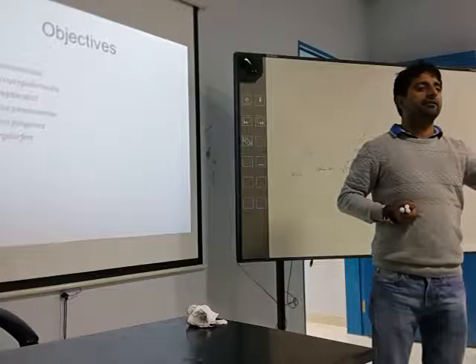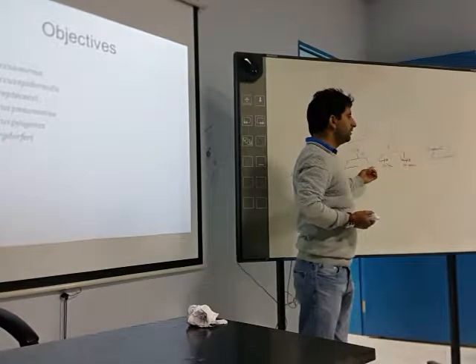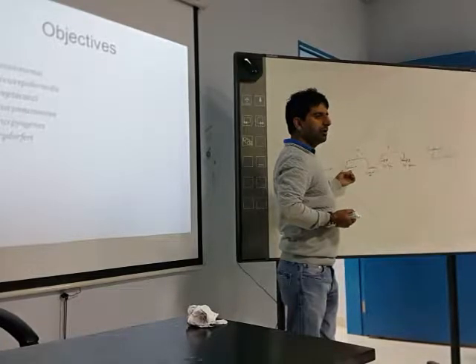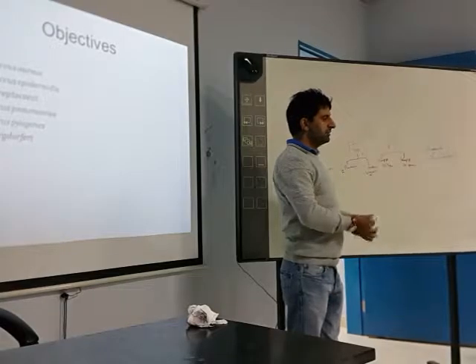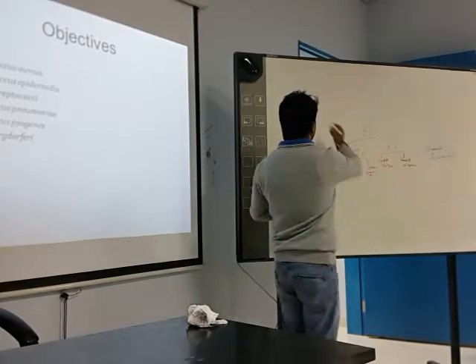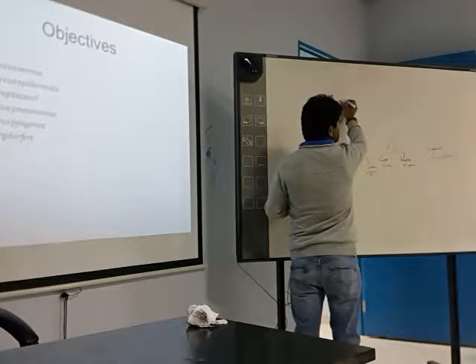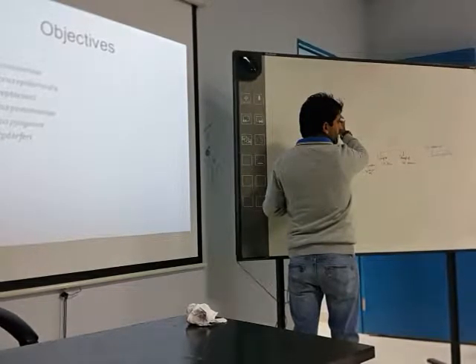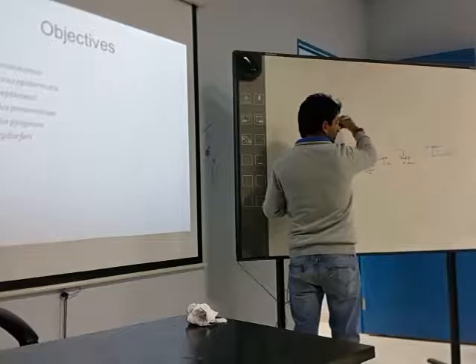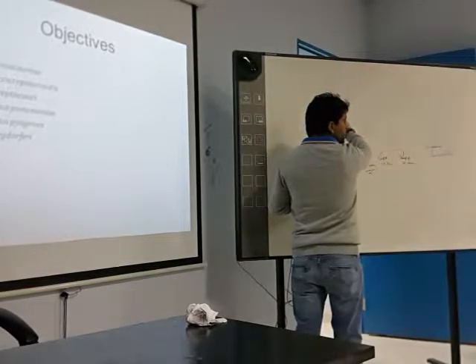Why is Streptococci green in color? Why is pneumonia green in color? It is partial hemolysis. It is called alpha hemolysis. Alpha hemolysis is also called partial hemolysis. Partial hemolysis means when this bacteria acts on the culture, on the RBC, the red blood cell is not totally destroyed, it is partially destroyed.